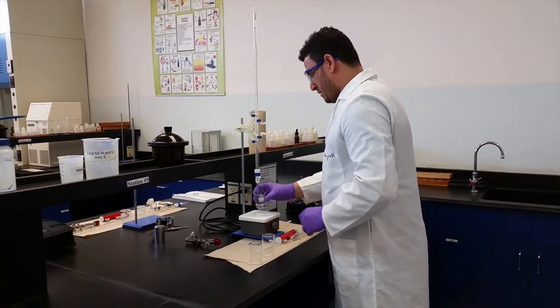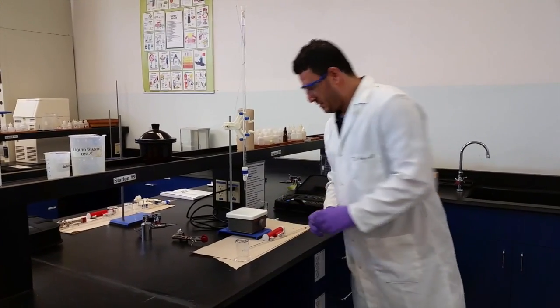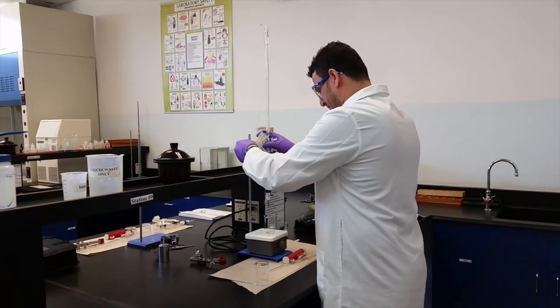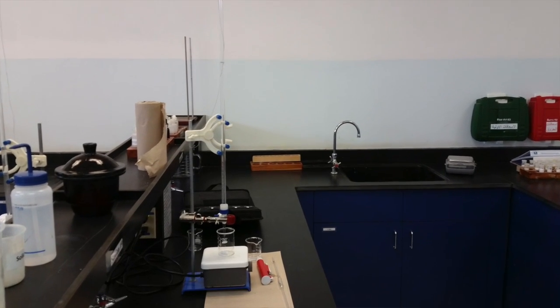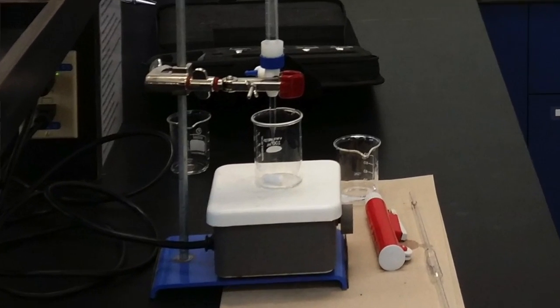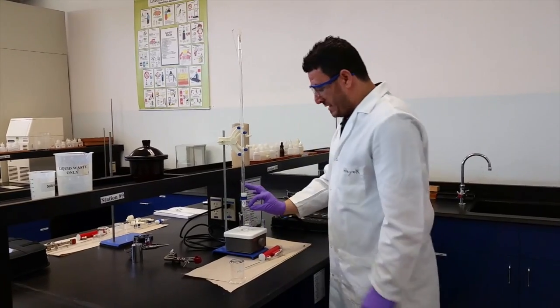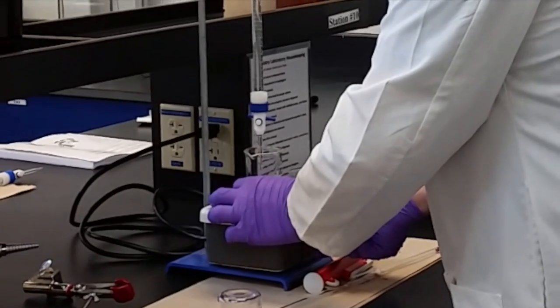So once you fill your burette, you need to take your acid, but before that, you need to finish the experimental setup. Now always manage to have the beaker in the center of the stirrer with your magnetic bar, and also manage to have the graduation of the burette toward you, and that the burette tip is inside your beaker. Make sure that your stirrer works.